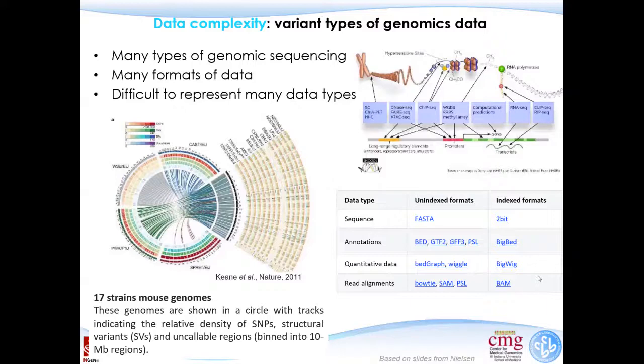And we also have different file formats from different sequencing platforms. With so many formats and so much data, it's really challenging to visualize multiple layers of the data in a figure.